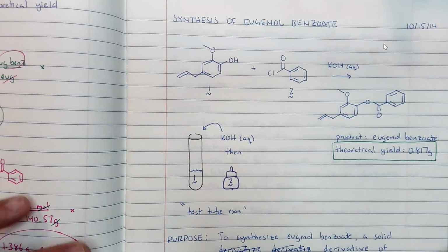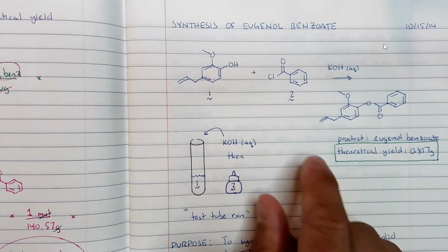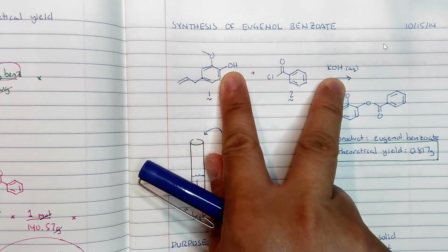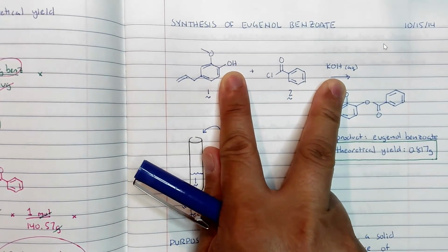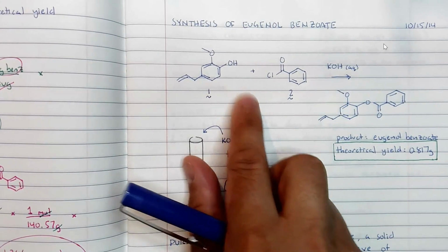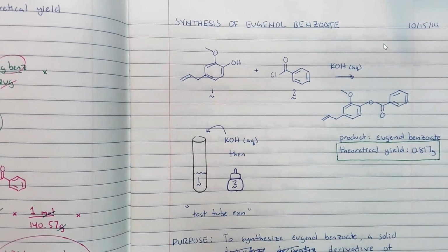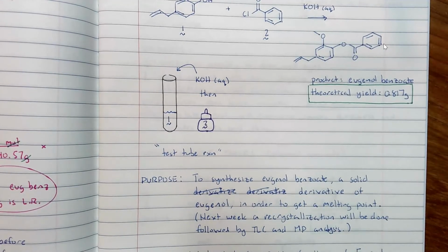It's an interesting reaction, but I'm not going to have time to go over the mechanism. Okay. The acid-base reaction between that OH and the KOH is something you should know, but the rest of it is organic chemistry too. But we're not worried about the actual mechanism. We're worried about how do we set up the lab notebook properly.